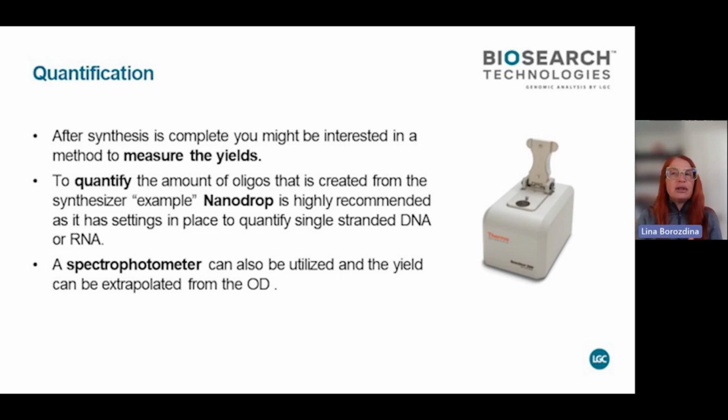My all-time favorite is BioTek. It's one of the small compact instruments, works really well. There are also different old ABI readers, etc. You can get one of those readers not just for 260, 280. If you're doing fluorescence, there are some that do dual wavelength, so it will read your concentration of a fluorophore as well.